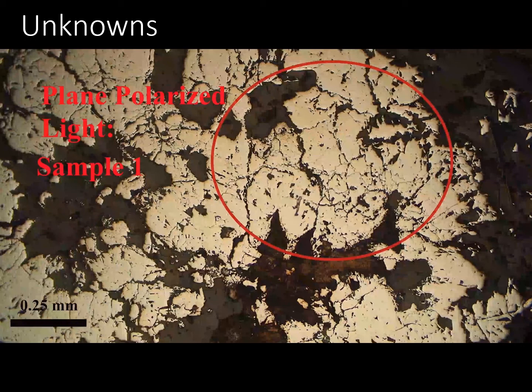So I think you should probably open up that file so you can look back onto the other minerals as we go through the videos and just jot down for each sample what the color is, whether it's bireflectant and whether it's anisotropic and what colors are associated with that. And then you can hopefully in your groups work through what samples you think the different videos are. So we'll just go through the videos now.